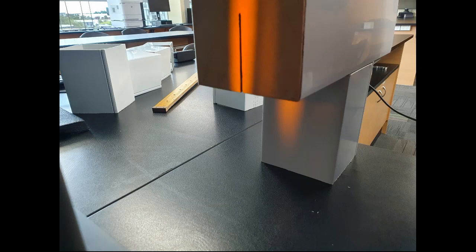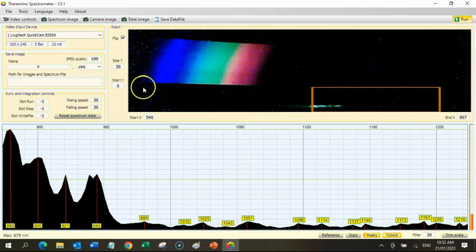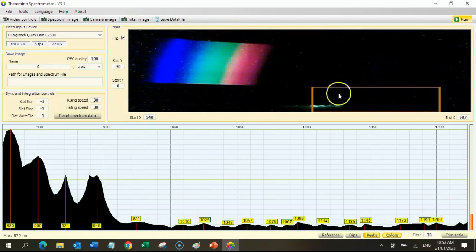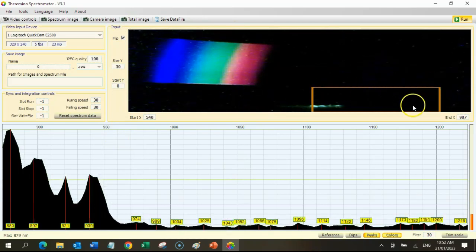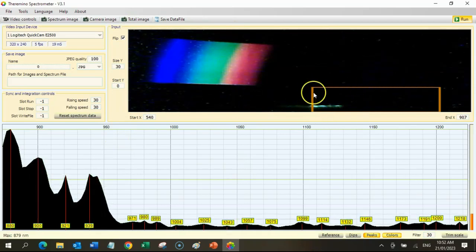The screen without any particular light source might look something like this. The screen shows a spectrum coming from a white sheet of paper.